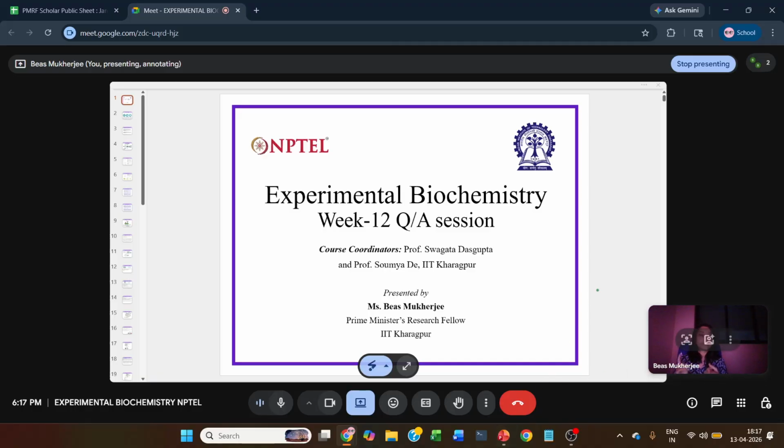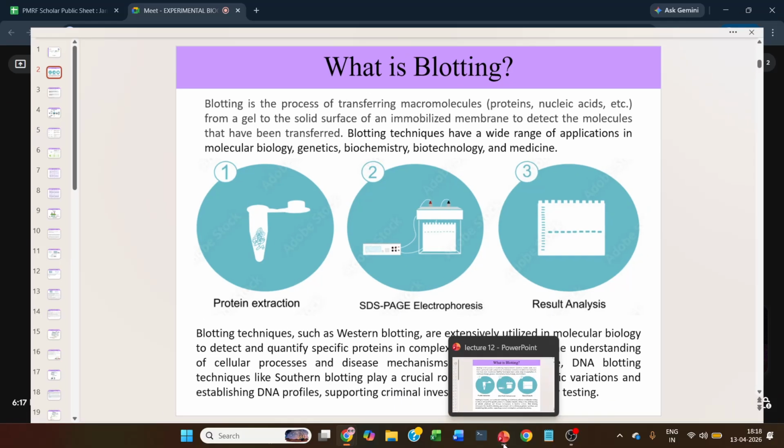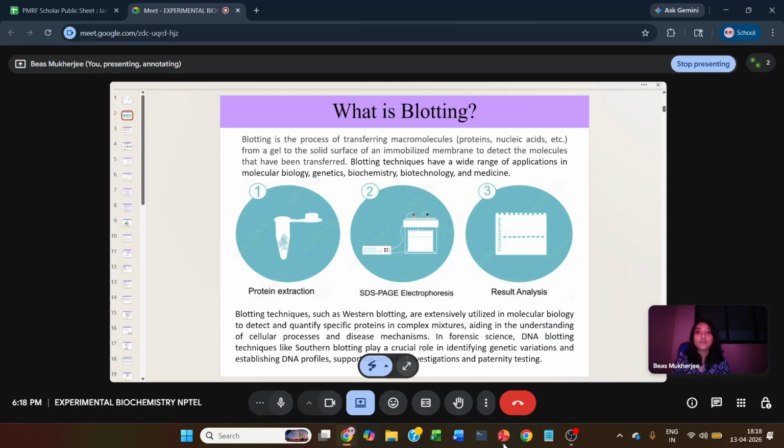We are going to discuss northern blotting, southern blotting, western blotting, and all other associated blotting techniques in detail. And then we are going to discuss a lot of previous year's questions. Right. So what is blotting? Blotting is the process of transferring molecules.